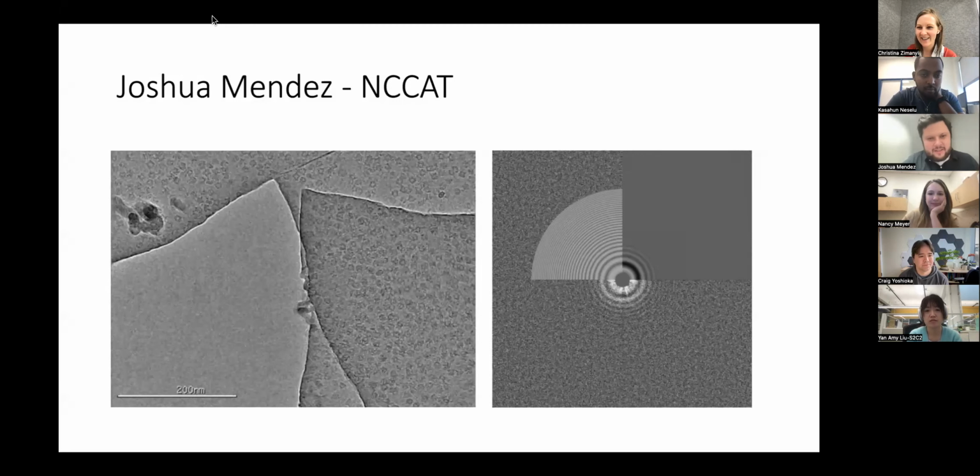Hi, everybody. I'm a scientist at NCCAT as well, helping users in general. So I chose this image because every once in a while, similar to Craig, I see something that I did not suspect to see on the micrograph. So here we have a very thin ice that broke as it was being collected, but instead of moving away, it kind of just landed on top of the ice next to it, very gently, to the point that when the image was collected, you still have a noticeable power spectrum signal that you're able to fit and you actually get a decent CTF out of it.